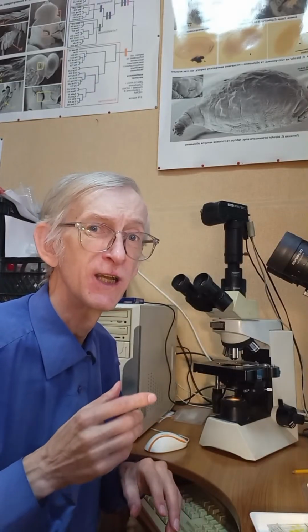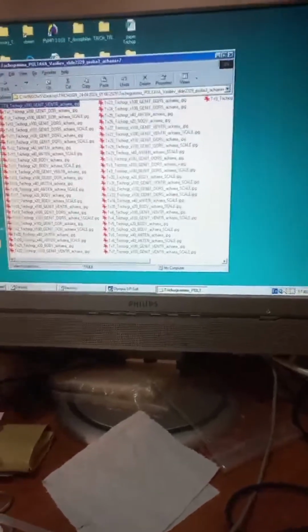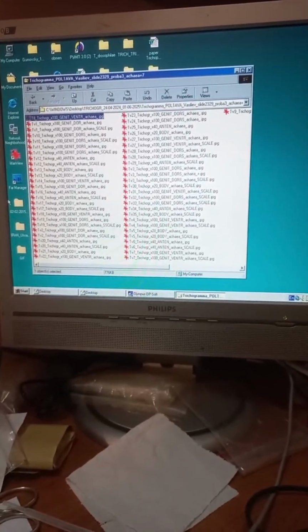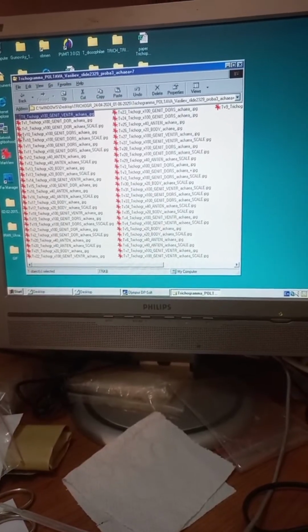It needs taxonomical control, and I'm doing taxonomical control, taking photos, watching photographs and making identification. Let's go forward to the computer and I'll show you some photographs that I already took. I will bring my telephone with me. Yes. Now I need to switch on the camera to the computer. Okay. Now you see here, I took 35 photographs of one species in the culture of Trichogramma achaeae.